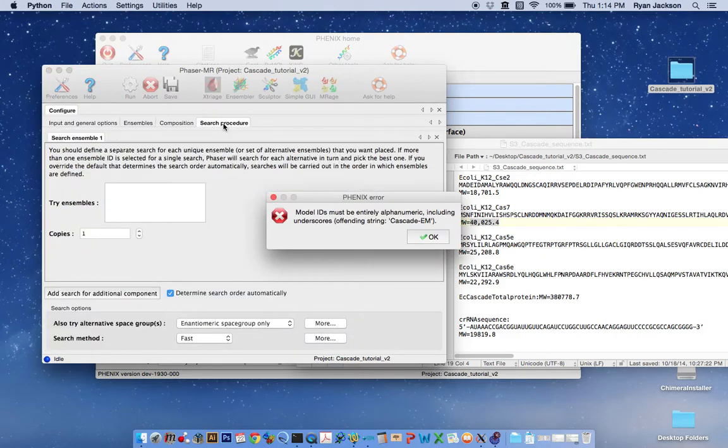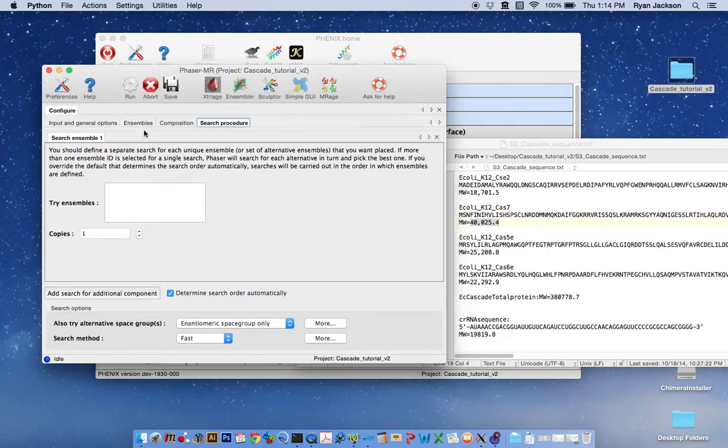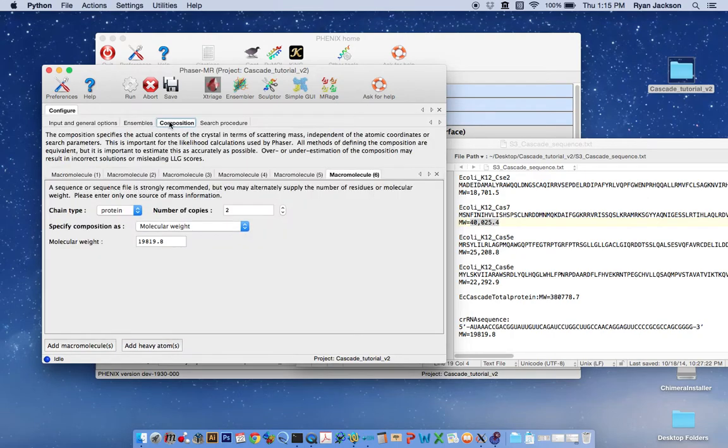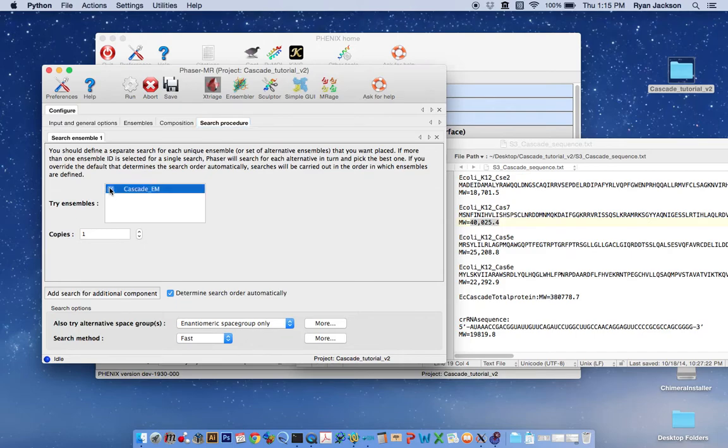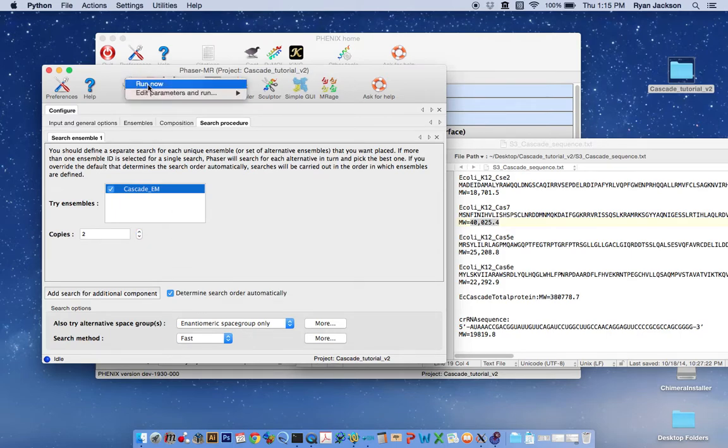Now we need to define what the search procedure is. This is upset that I have used a dash in defining my ensemble. So I'm going to hit okay and go back here and fix that to an underscore. And that should work. I believe that there should be two cascade assemblies in the crystal or the asymmetric unit of the crystal. And so I'm going to have it search for two copies and I'm going to hit run. Run now.